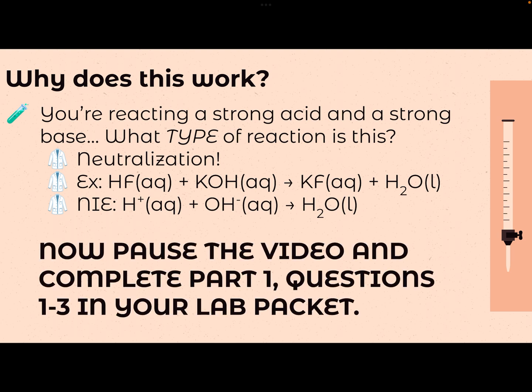Okay, what you're going to do now is you are going to pause this video and you're going to go into your lab packets and make sure you complete part 1, that part of the pre-lab section, but you're just going to do questions 1 through 3 for right now. You should be able to answer all of these. I will just refer you to your notes packet for question 2B, where we learned how to make solutions. It is going to involve a volumetric flask, so make sure you have that somewhere written into your procedure. I would say your procedure should be 4 steps long for that one, for 2B. All right, pause the video, answer those questions, then come back.